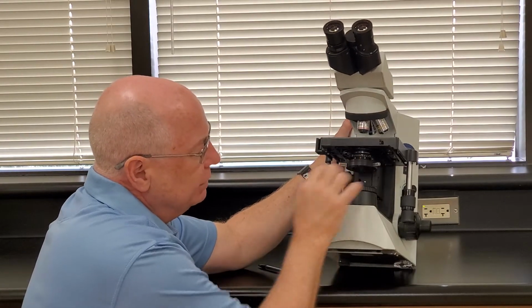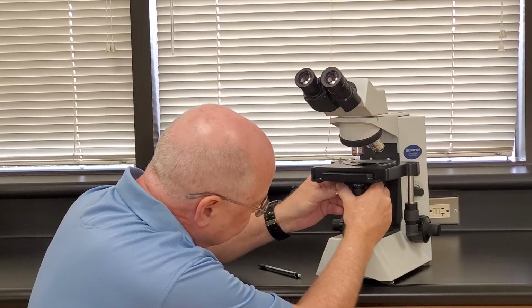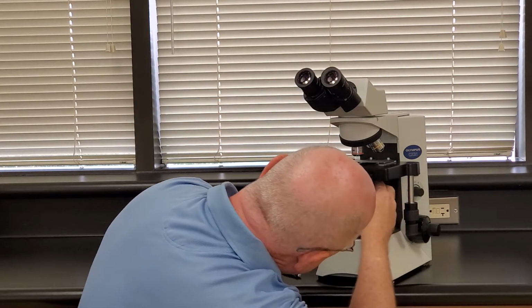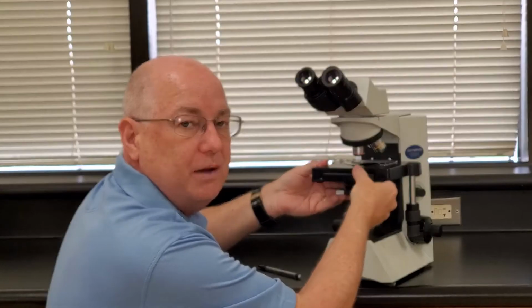So when we shine light out of this light source, it's going to go out in an infinite number of directions. So right above it is this little black cylinder looking thing that has these two little metal pieces sticking off, and that is called a condenser. And although I probably shouldn't do this, I don't want to loosen it, but we have one of our scopes where the condenser pops off.